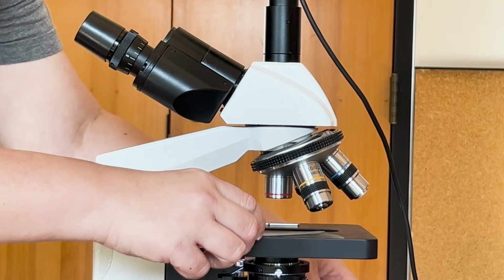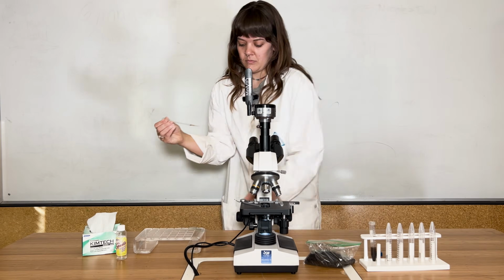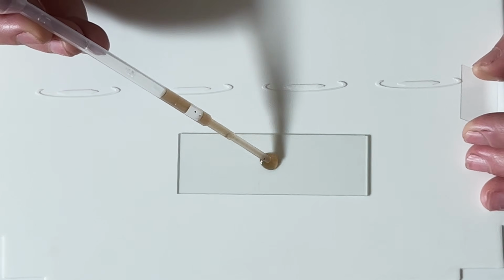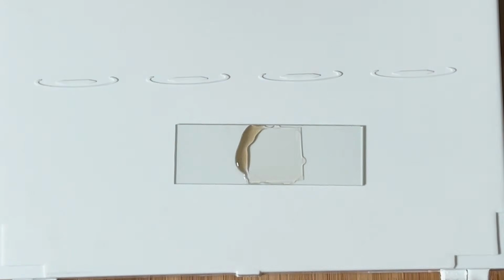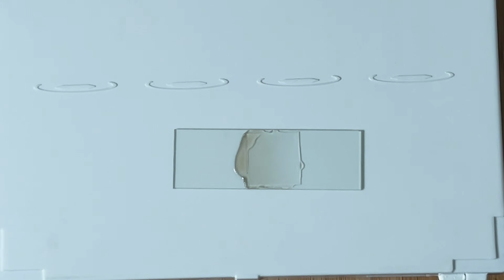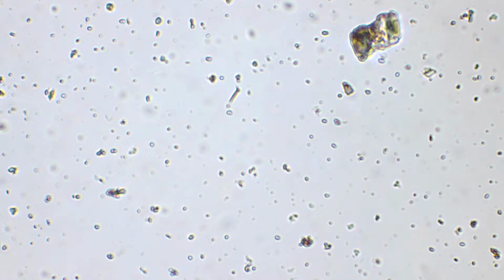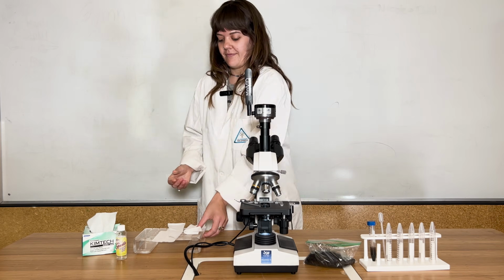Placing the cover slip can also take a bit of practice. If your droplet has too many large particles, it can make the cover slip lay unevenly and you may have trouble focusing. If you pipette too much water onto the slide, the sample will leak out from the sides of the cover slip. This causes a lot of swirling and movement when viewing your sample and makes it difficult to examine organisms closely. If this happens, grab a new slide and try again.